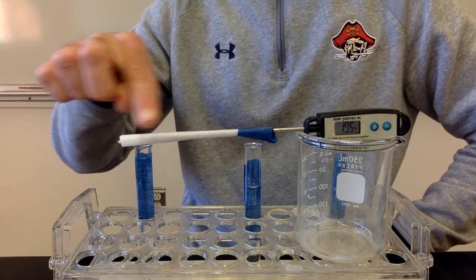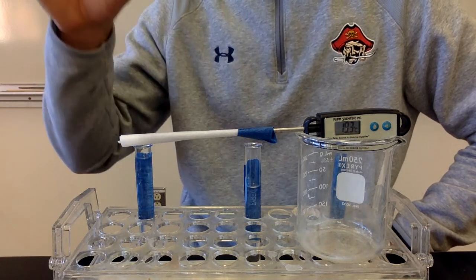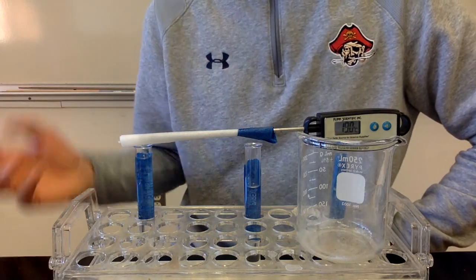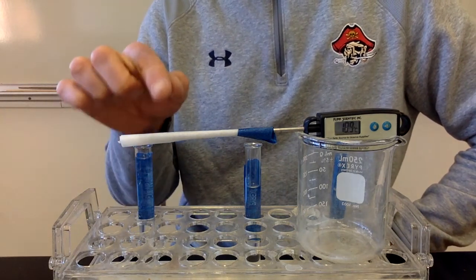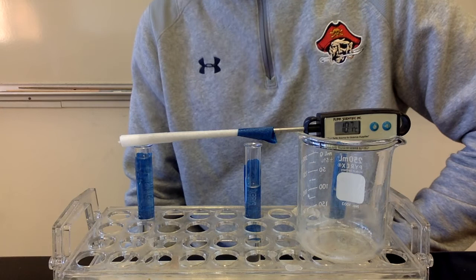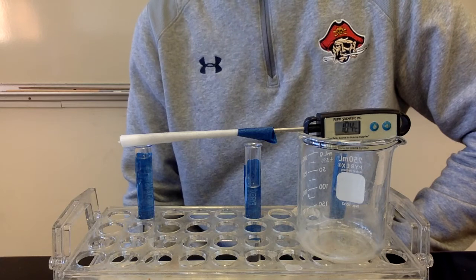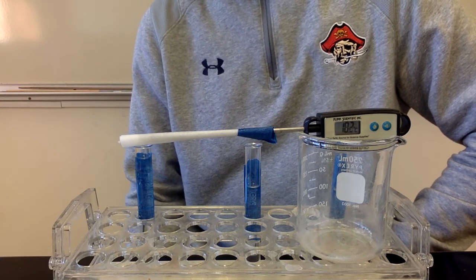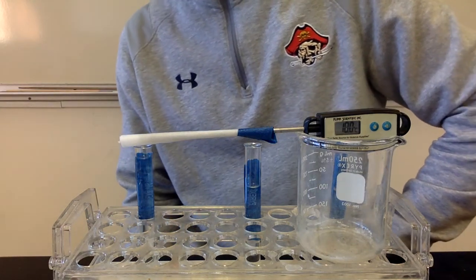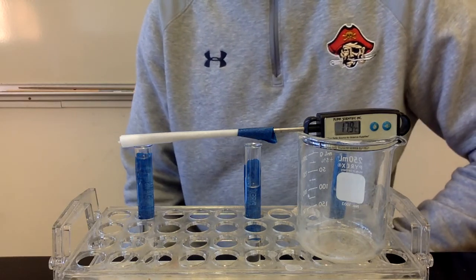What's happening right now is that this piece of paper is wet and it is slowly evaporating. It's slowly turning into a vapor. And as it turns into a vapor, it needs to absorb energy. In order to change it from a liquid to a gas, you have to break those intermolecular attractions, that force that's holding it together as a liquid. And so to break that attraction, to break those intermolecular bonds, you need to absorb energy from the surroundings. And as it absorbs energy from the surroundings, this little piece of paper and this thermometer get colder. So you can see the temperature is dropping a little bit as it turns from a liquid to a vapor.